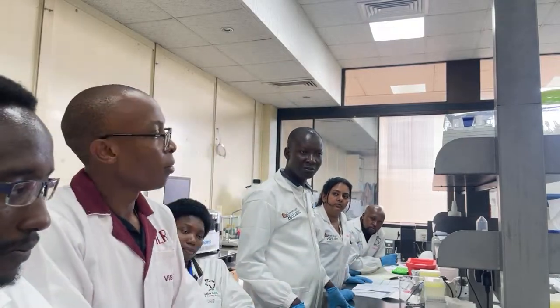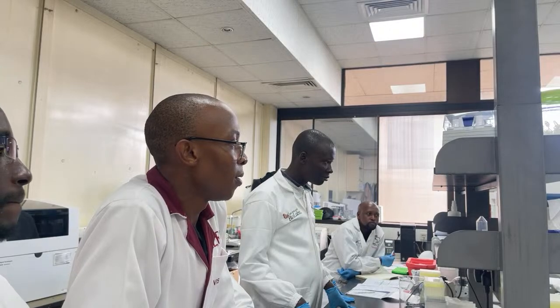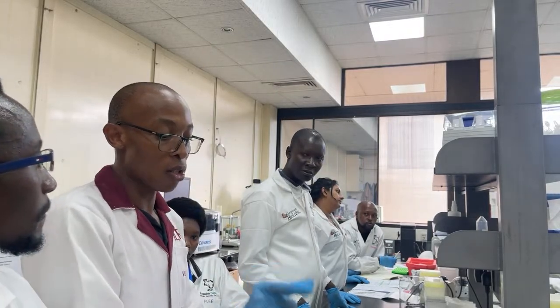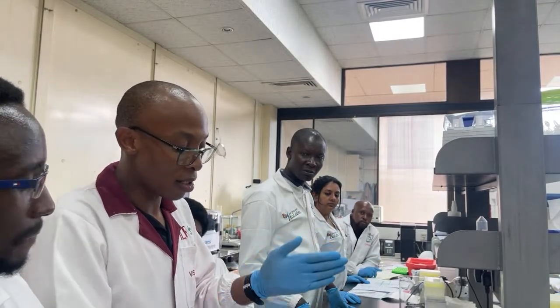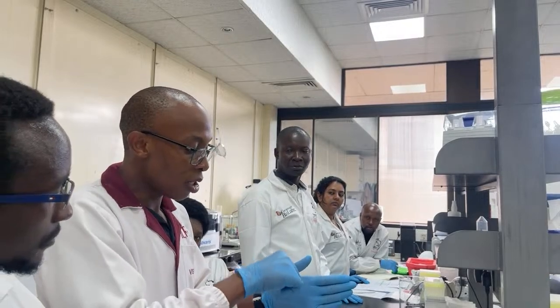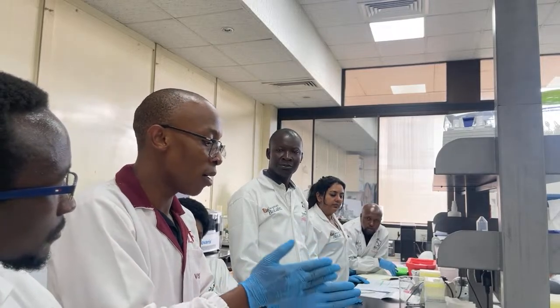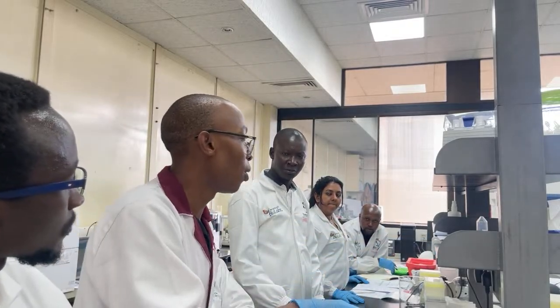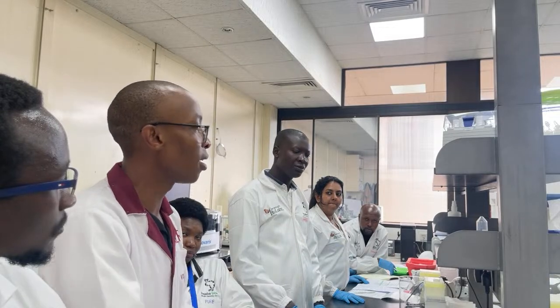If, for example, I want a specific amount of data, can I keep what remains for another run? No, the SMRT Cell is a once-off use. Remember you have 4 in a tray. You have 4 SMRT Cells that correspond to 4 reactions. Once a SMRT Cell is used, the advantage is that the complete reaction kit is still usable. You can come back the next day and load the same reaction onto the second SMRT Cell.